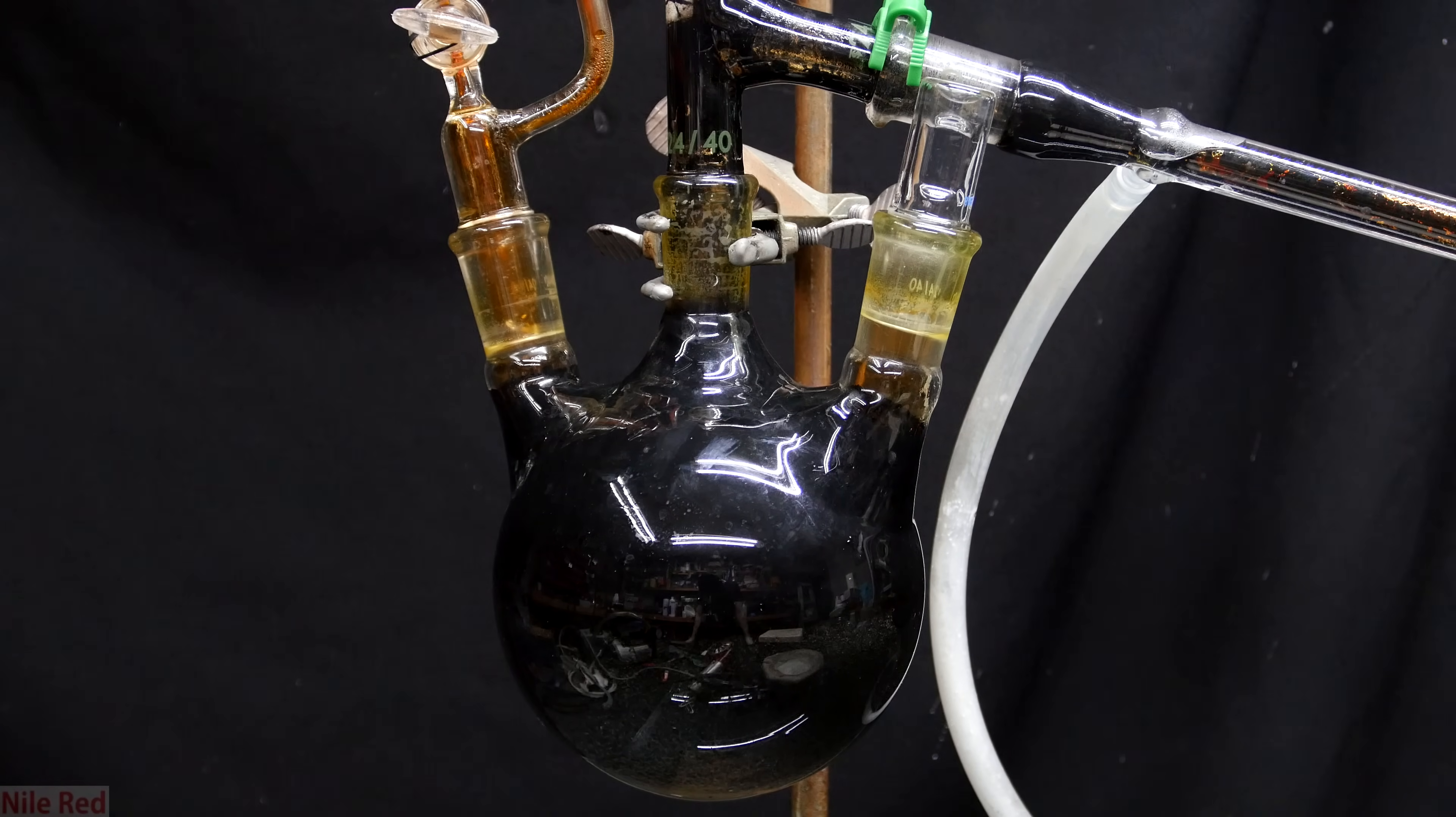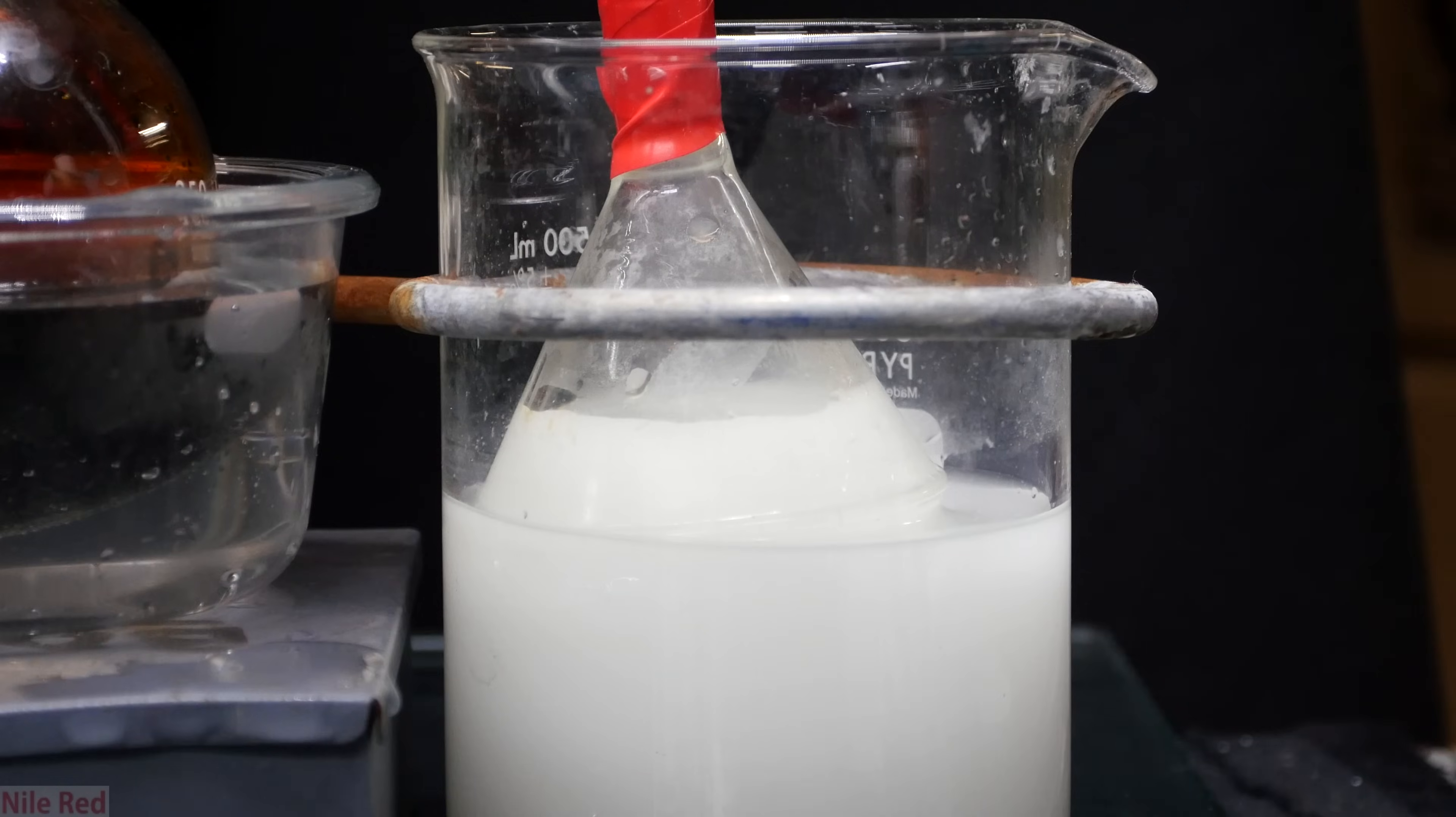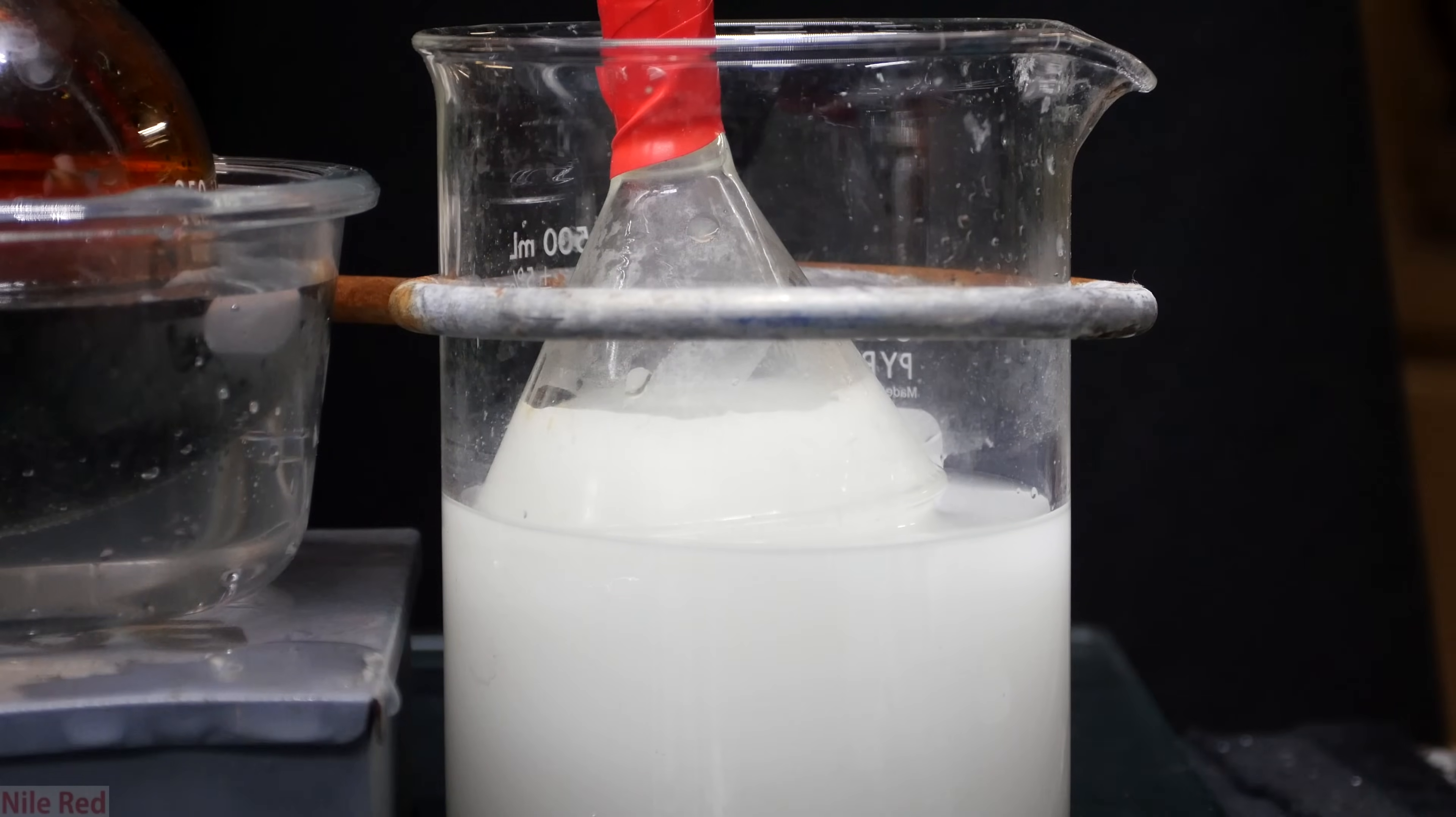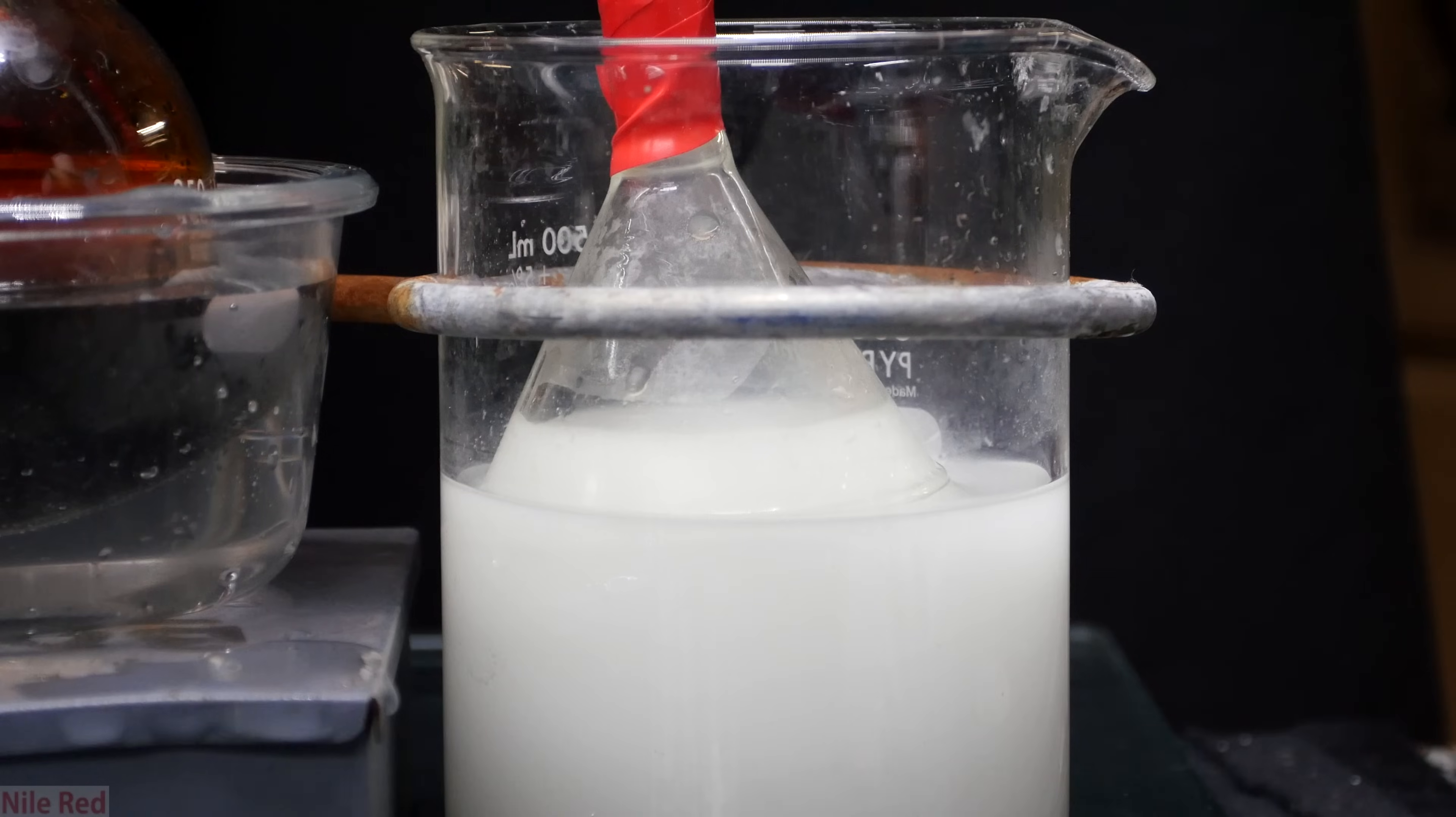Anyway, once it's done, the flask is taken off heat and allowed to cool. Just pretend that you can't see me standing there in the background. Here I want to illustrate the purpose of the inverted funnel trap. As the apparatus cools down, the air volume inside it will shrink and because of this, it pulls a slight vacuum.